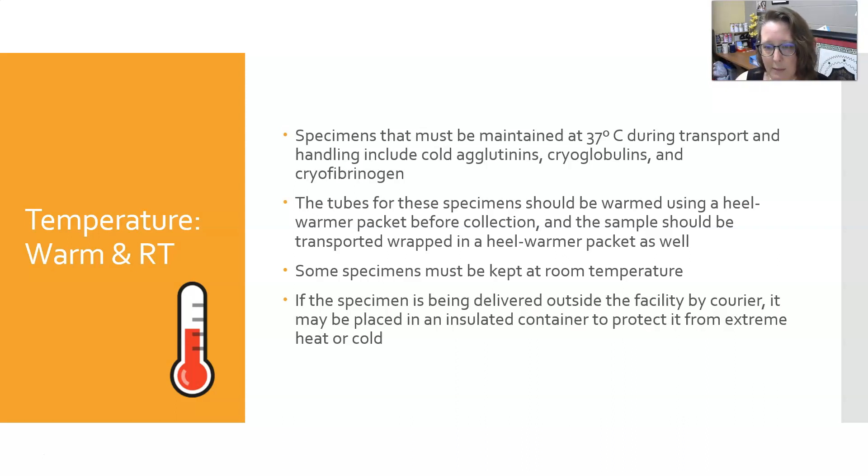Some specimens must be kept at room temperature, which is usually not a problem in the hospital. But if the specimen is being delivered outside a facility by a courier, placed in an outside drop box, or driven around, it should be put in an insulated container to protect it from extreme heat or cold. An outside drop box should also be insulated to protect from extreme heat or cold.